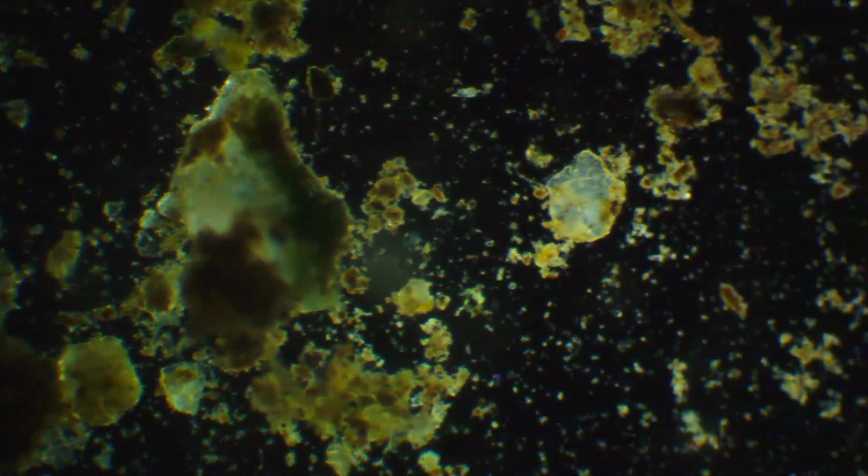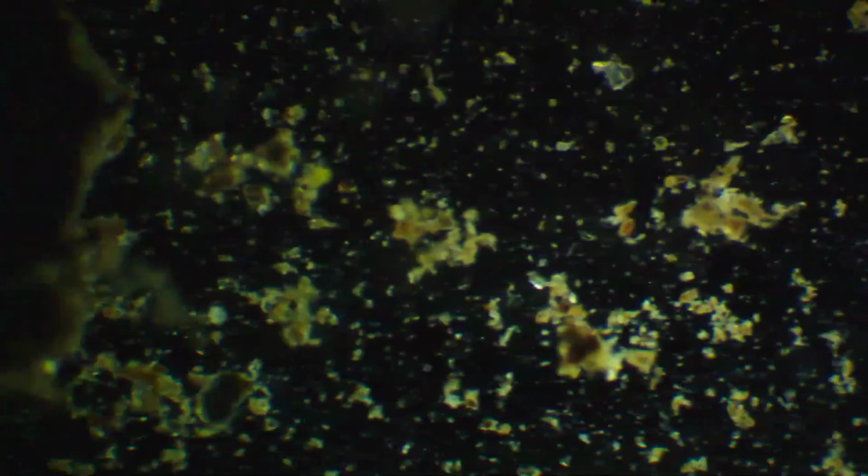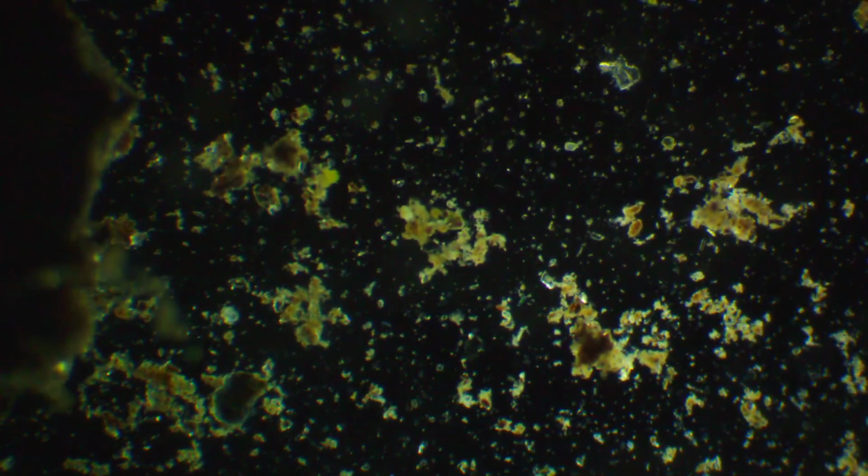You get maybe some kind of plant material that is floating on the surface that is 5,000 times bigger than your body, and you're just going to eat it anyway, because you're just a little bug. I mean, little friends in here swimming around, eating the moss. That's what they do.